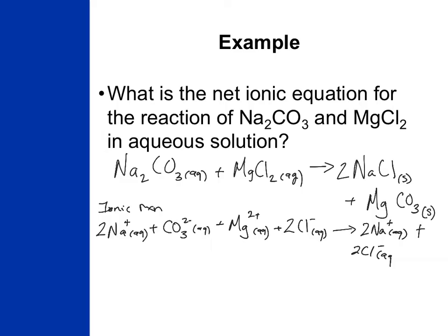Wow, did I write solid up there? Wow, that's bad. This is aqueous. And then we're going to have magnesium carbonate forming as a solid.